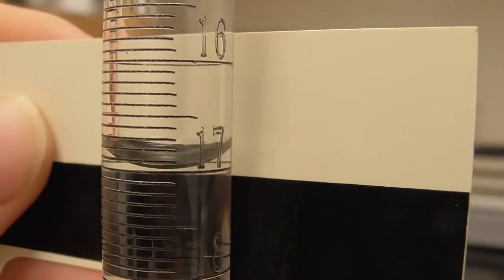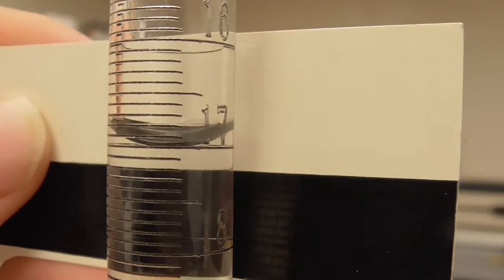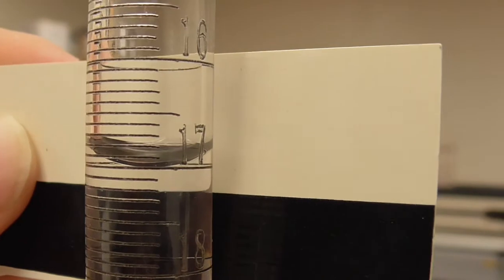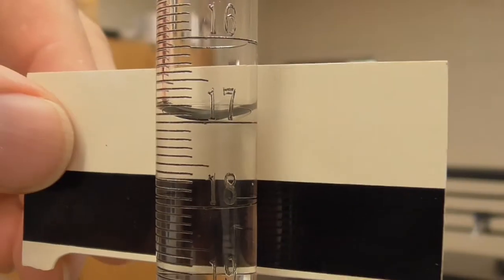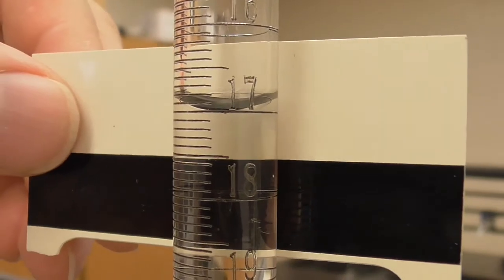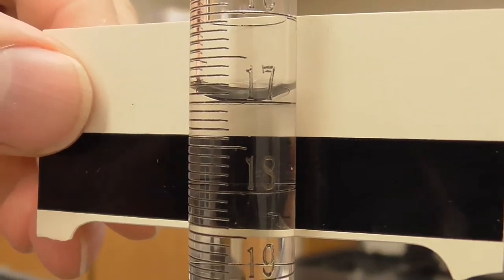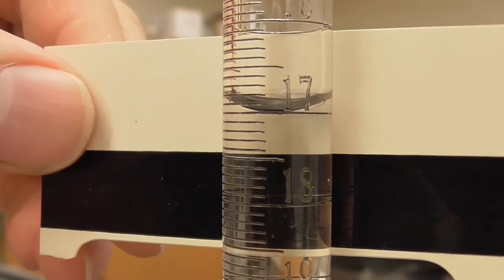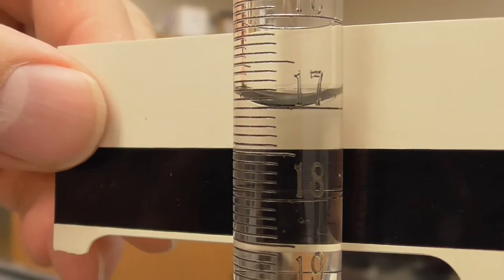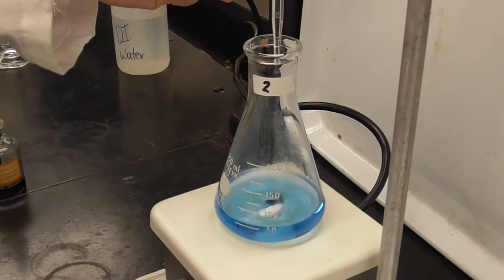And there's our final burette reading for sample number 1. Okay, we're ready to start with sample number 2. And since it didn't take a lot this time, we're going to just leave the burette where it was. So this is now the starting point for sample number 2. Okay, so this is sample number 2.